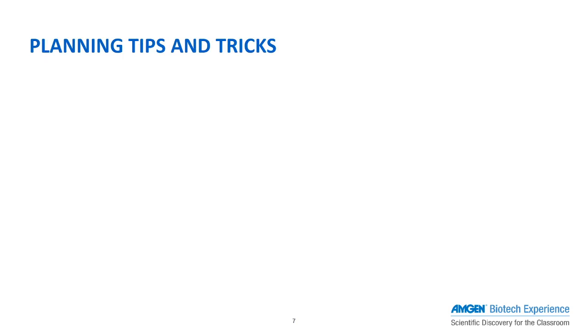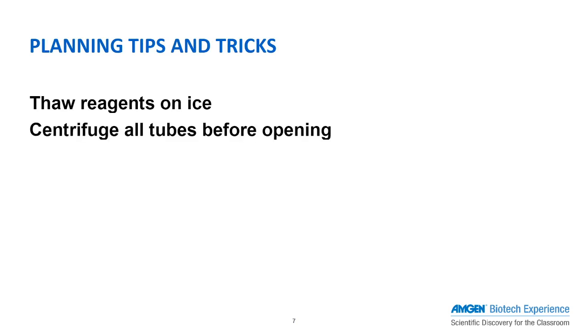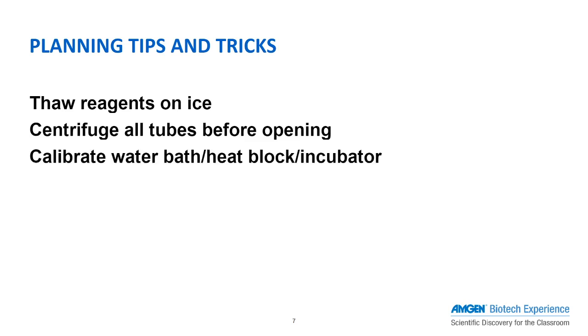For teachers, this laboratory takes some advanced planning and preparation. Remember to thaw reagents on ice when possible, and to centrifuge all tubes before opening them to avoid volume loss as you pop off the lid. It is also a good idea to calibrate the water bath, heat block, or incubator to the required temperature at least a day or two before you conduct the experiment.